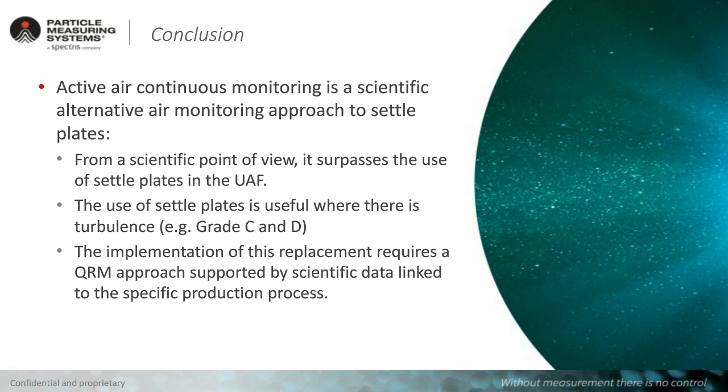As a consequence, people will be considering at this moment, now that we have a new era of regulation and understanding of pharmaceutical manufacturing, to implement active air sampling by replacing settle plates with active air sampling. There are certain ways of doing this, and under these aspects, I would like to hand over now to my colleague, Heather Mason, who would be explaining to you our concept and our strategy as a company, and as well how this ties into the replacement of settle plates by active air sampling.